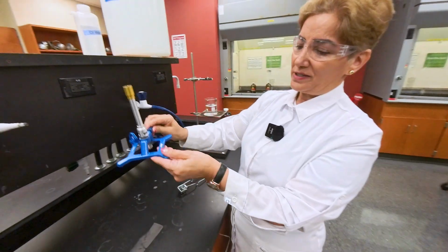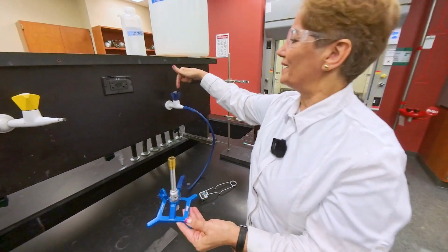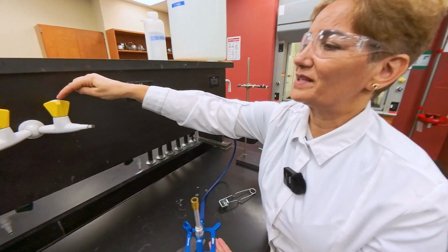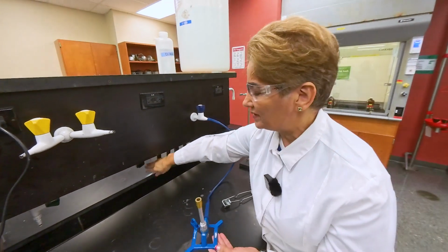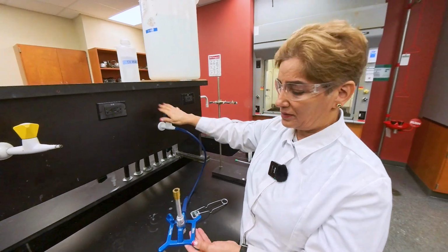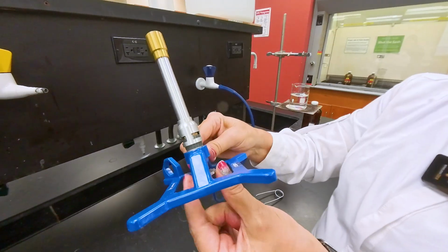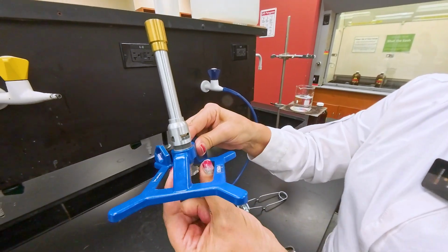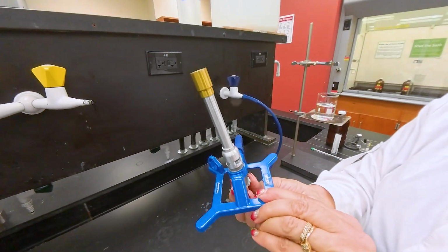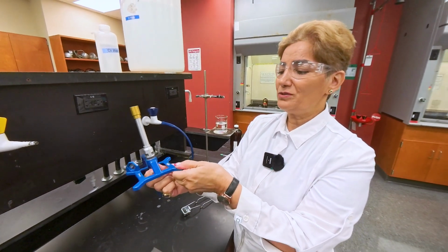What are you going to adjust? We have 3 valves that we want to adjust. This is the main gas valve, and on top it says gas, because we do have other valves that say vacuum, or water, or W, or VAC for vacuum. This is gas, the blue color in this lab. There is another valve underneath. This valve adjusts how much gas is let in to mix with the air for this reaction. And the old rule of righty-tighty, lefty-loosey does work.